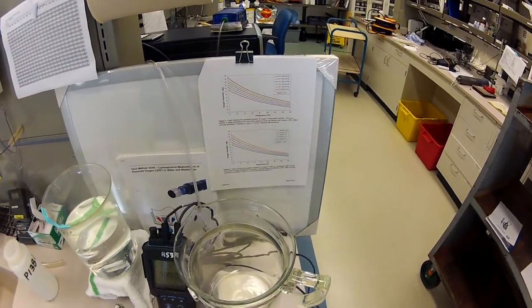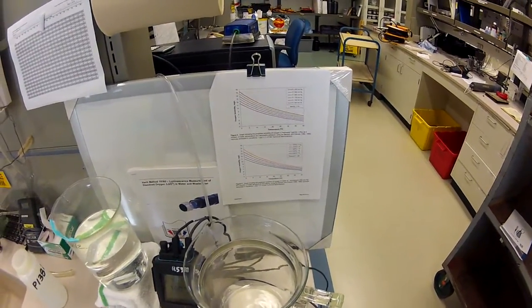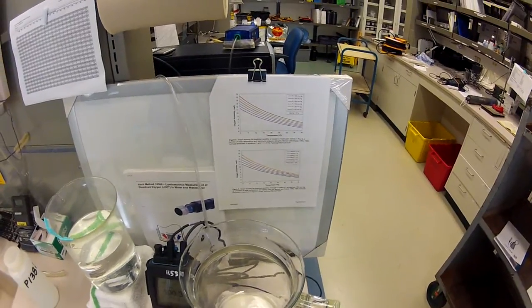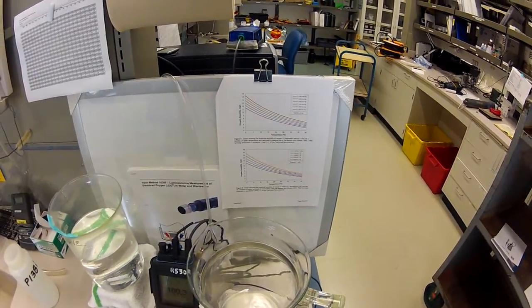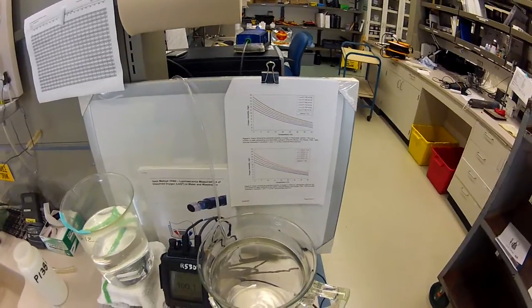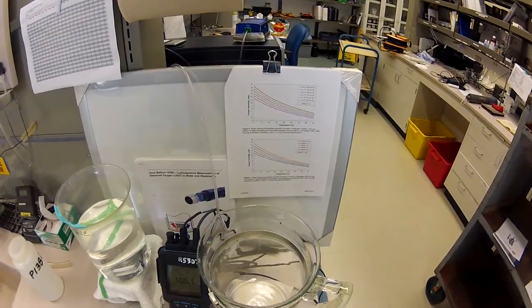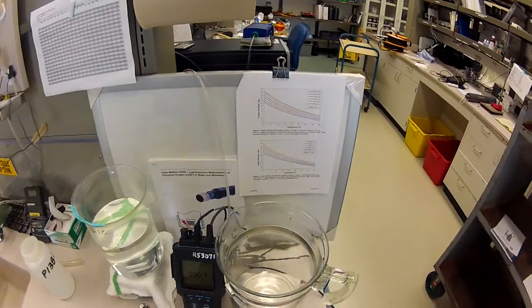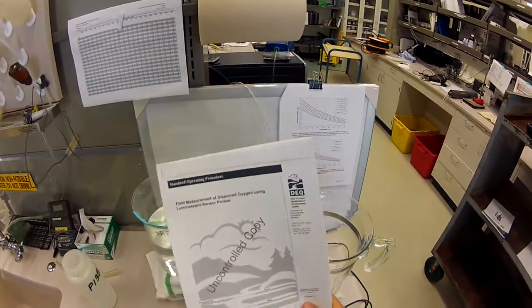I'm going to demonstrate how to make and then use air saturated water standard for checking on the calibration of luminescent sensor dissolved oxygen probes.